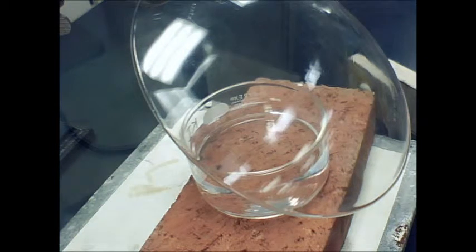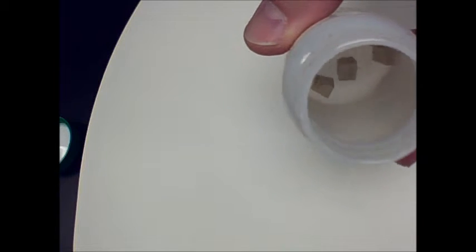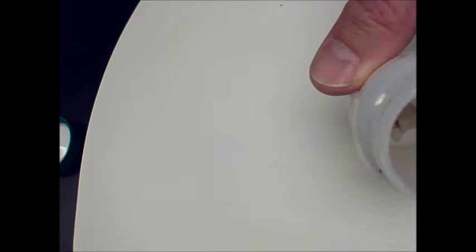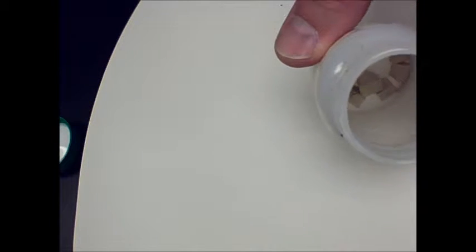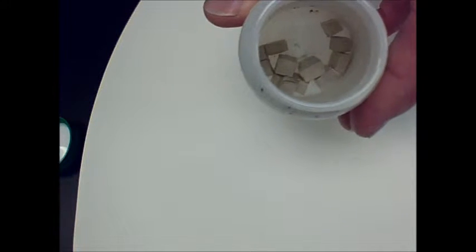Okay, so we have some sodium here. It's one of the alkali metals. And it's stored in a liquid, stored in oil to keep oxygen from getting to it. And even though it's stored in oil to keep oxygen from getting to it, you can see how white it looks. Can you see how white it looks in there?